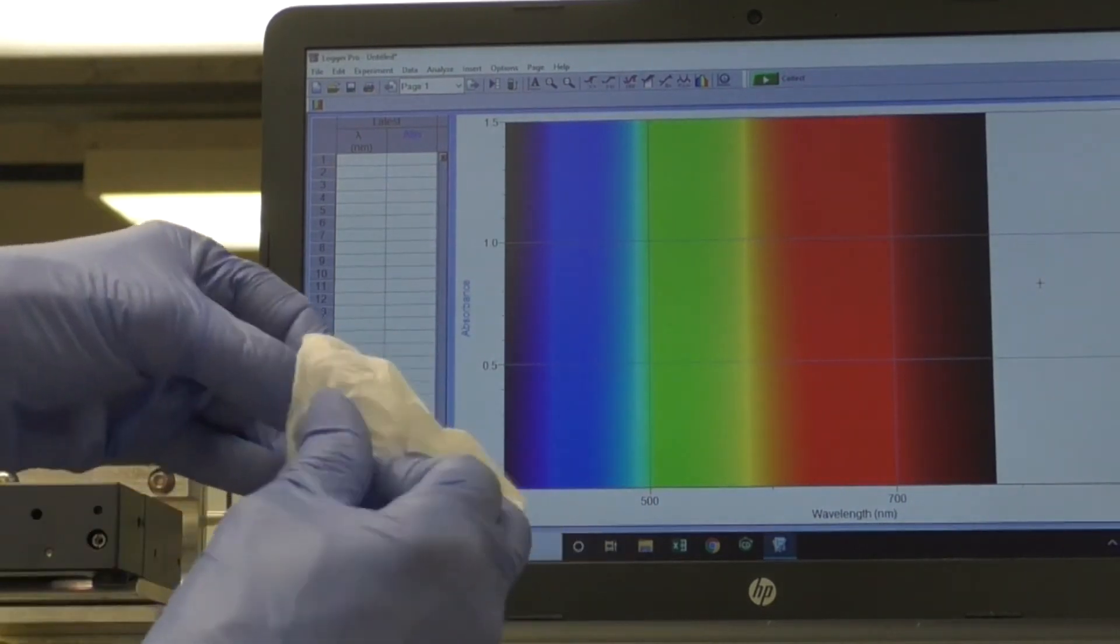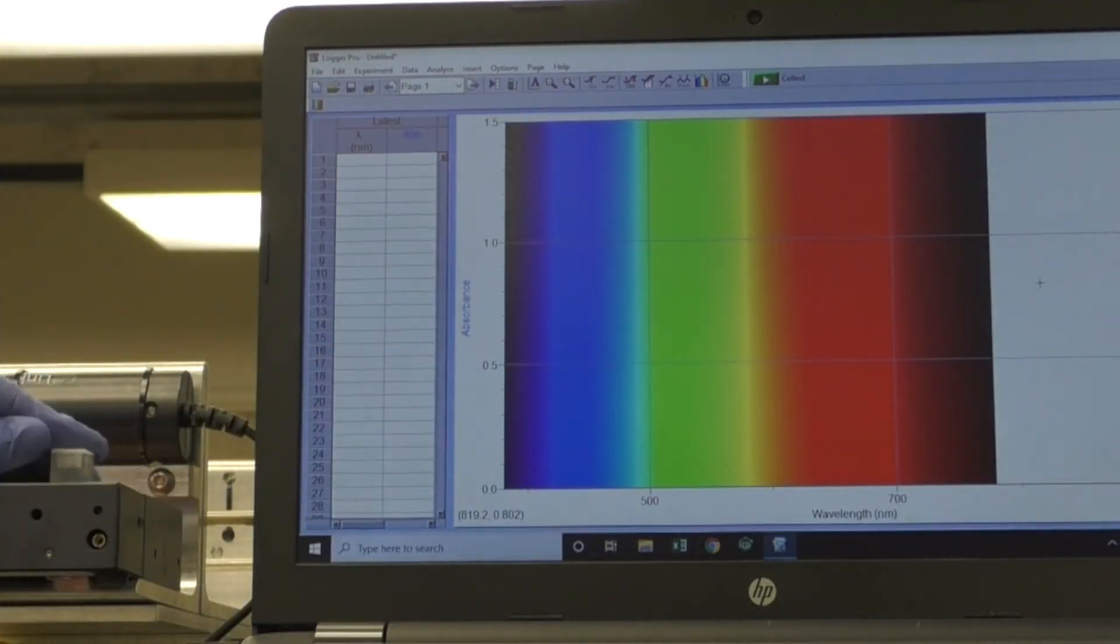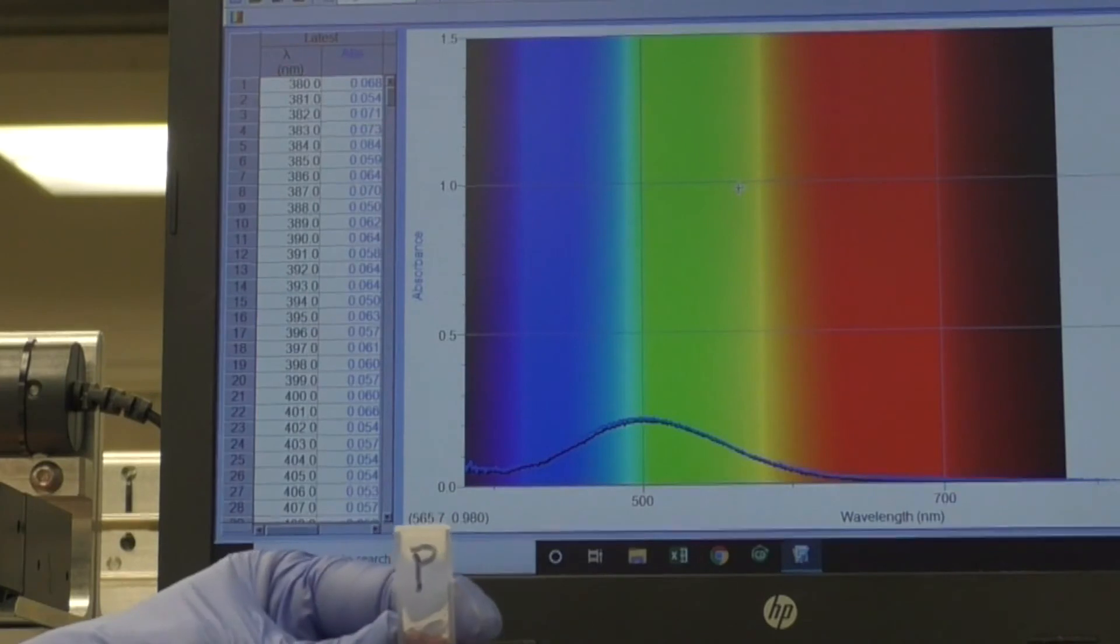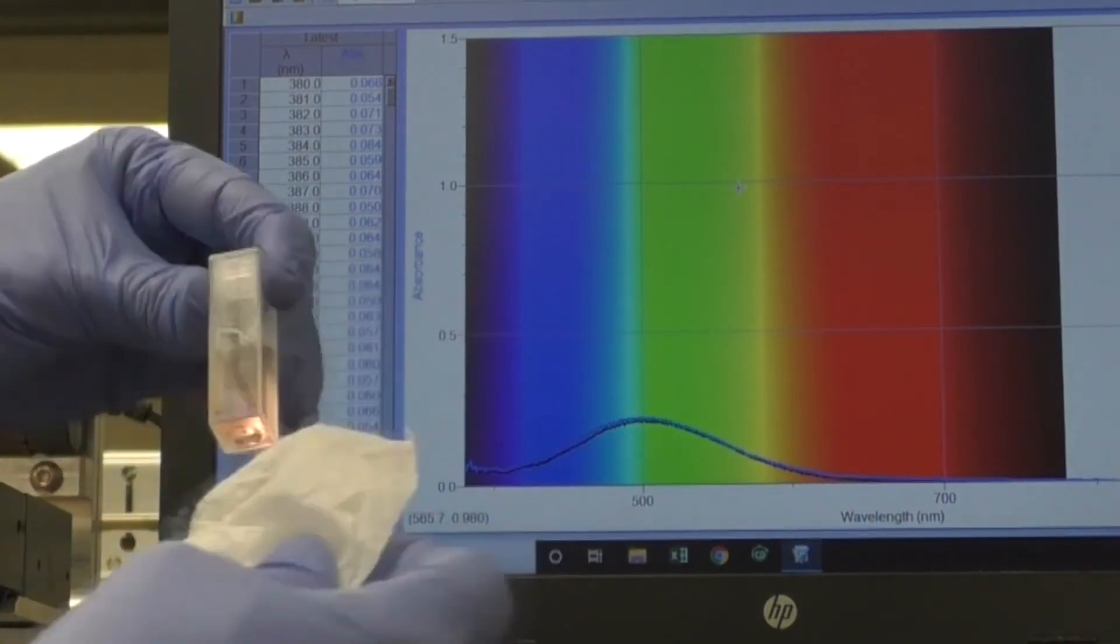When 5 minutes has passed, wipe the standard cuvette, place it in the spectrometer and click collect. Wait a few seconds and click stop. Repeat this being sure to choose save latest run with the patient's cuvette.